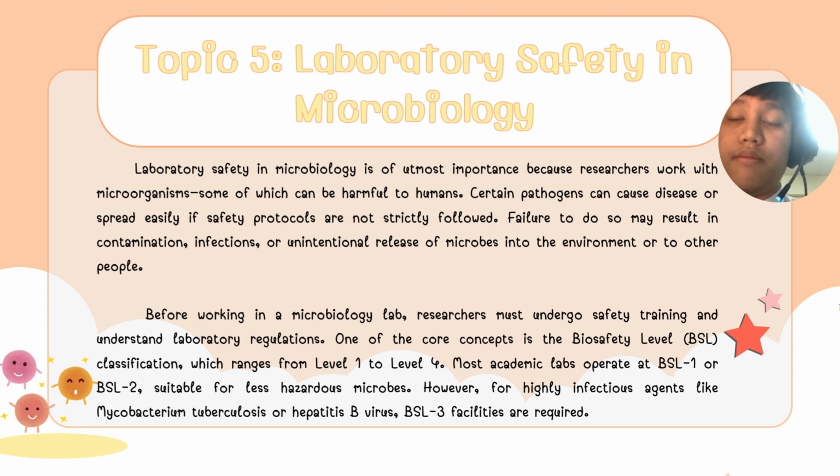Laboratory safety in microbiology is of utmost importance because researchers work with microorganisms, some of which can be harmful to humans. Certain pathogens can cause disease or spread easily if safety protocols are not strictly followed. Failure to do so may result in contamination, infection, or unintentional release of microbes into the environment or to other people.